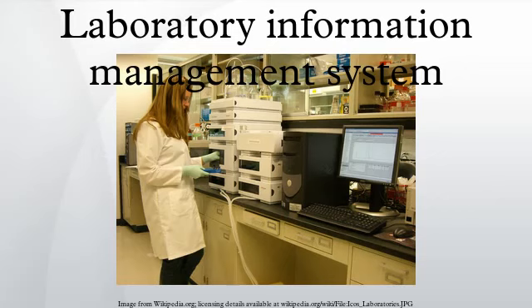Dr. Alan McClelland of the Institute of Biochemistry, Royal Infirmary, Glasgow highlighted this problem in the late 1990s by explaining how LIMS is perceived by an analyst, a laboratory manager, an information systems manager, and an accountant, all of them correct, but each of them limited by the user's own perceptions.